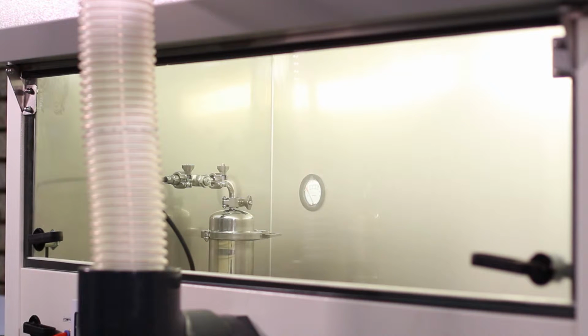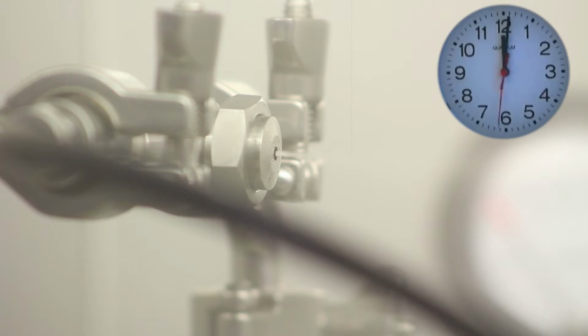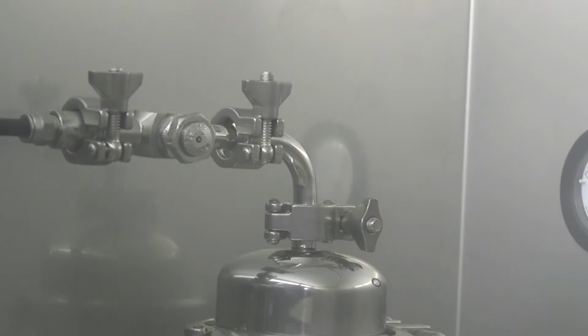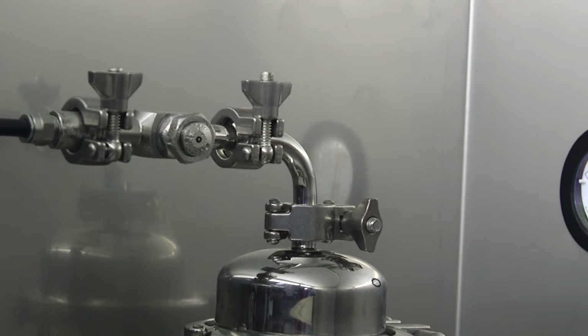This unique solution is diffused by a dry fog system, which generates a dense fog inside the hermetically sealed cabinet. The process converts the fog into water vapor and the decontamination agent into a gaseous state. After several minutes of diffusion, the fumes or fog must remain in contact with all the surfaces in the biological safety cabinet for 60 minutes to achieve adequate contact time. Once this has been done, the ventilation system may be restarted in order to eliminate the gas residue.